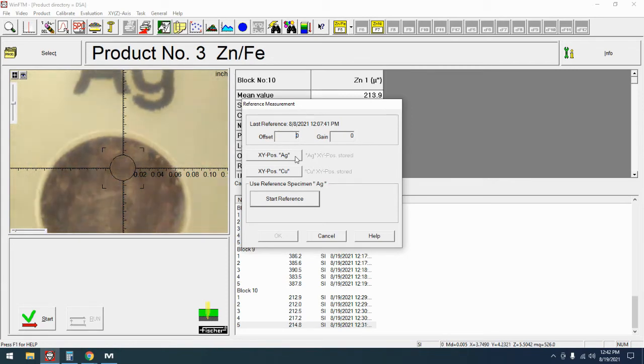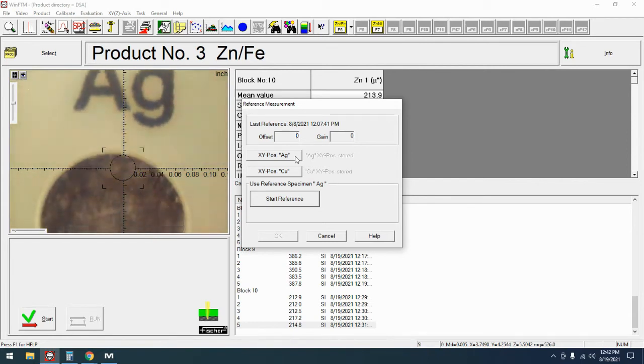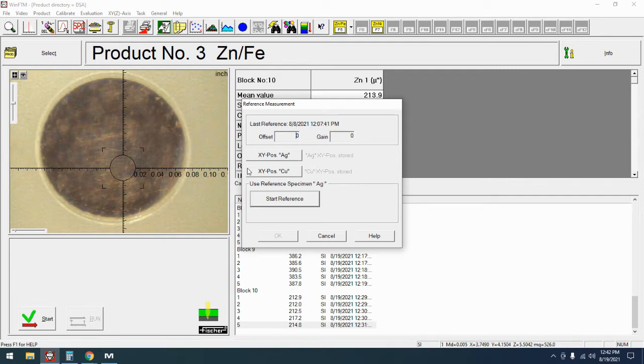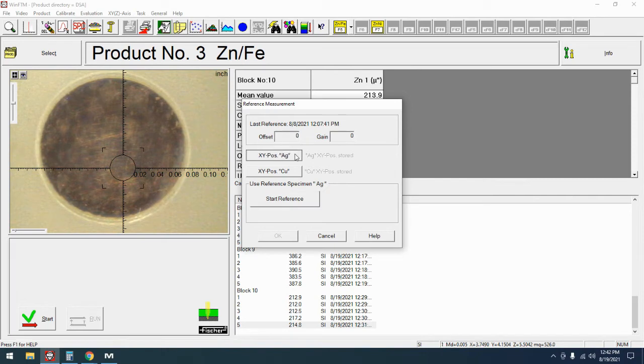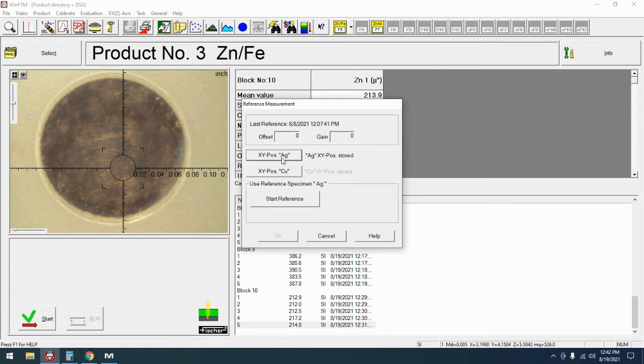Let's double check that I'm on the right one, so we're going to start here on silver and you can see right here where it says use reference specimen silver. If you have a manual stage you're just going to go right to start reference. With the programmable stage I'm going to sit here and I'm going to hit Ag X Y position and that's going to store that.